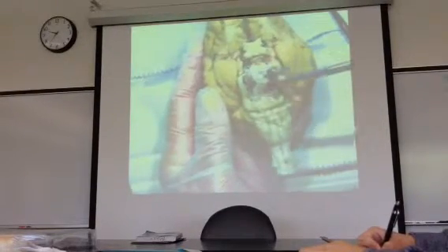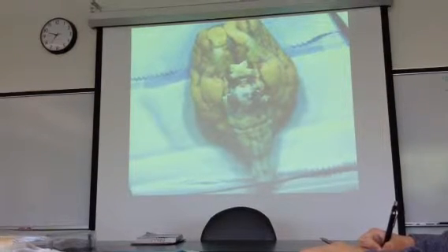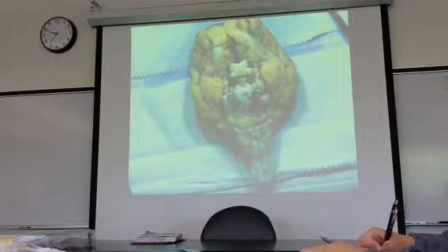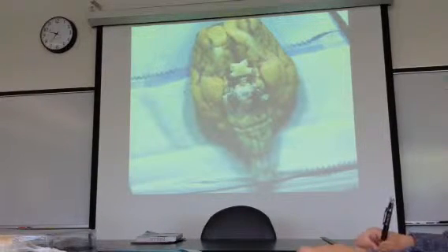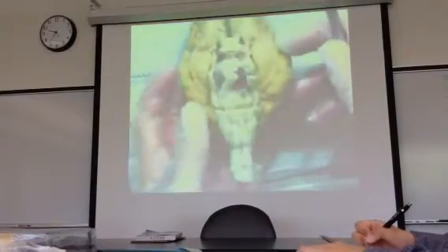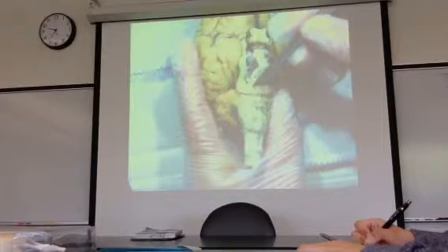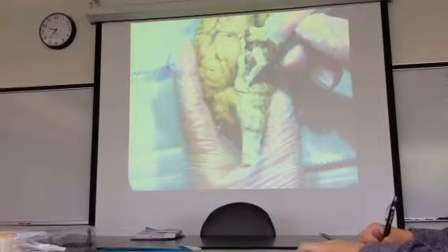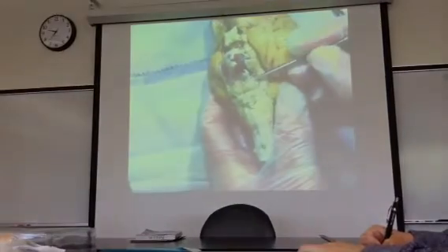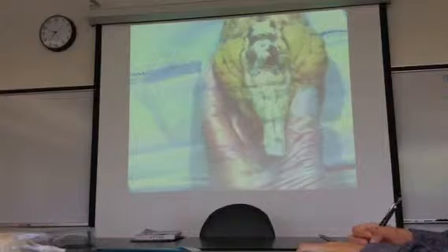When you tear off the pituitary, there's a bunch of tough white fibrous connective tissue wrapping a whole bunch of structures right here. If you just rip off the pituitary, you're going to lose a whole bunch of details that you have to know on the sheep brain. So you're going to have to be careful about this. The other thing you're going to have to be careful about is, can you see this really skinny structure right here? That's abducens 6. Here's another one. Abducens 6. If you just rip off the pituitary, you're going to lose those nerves too.